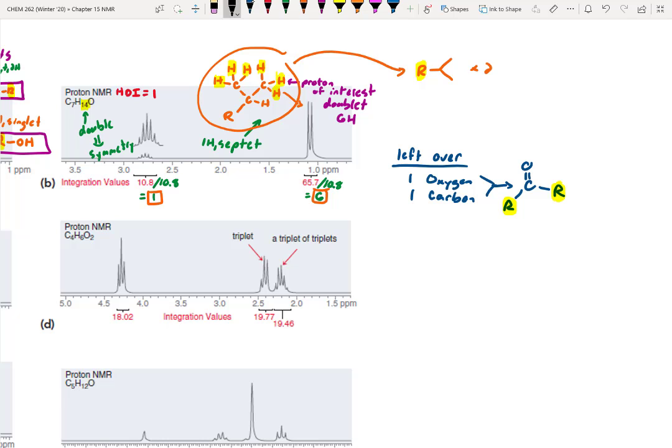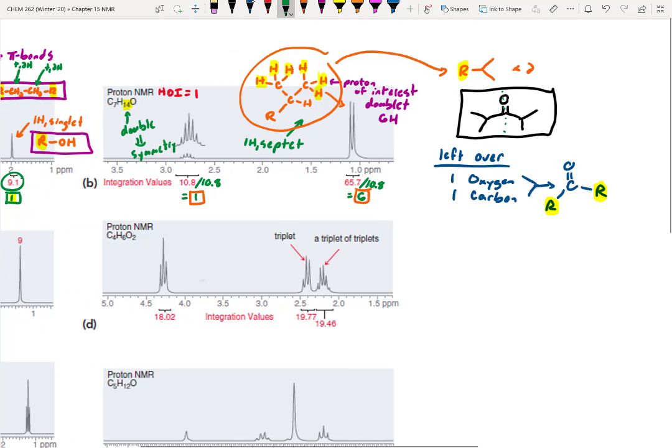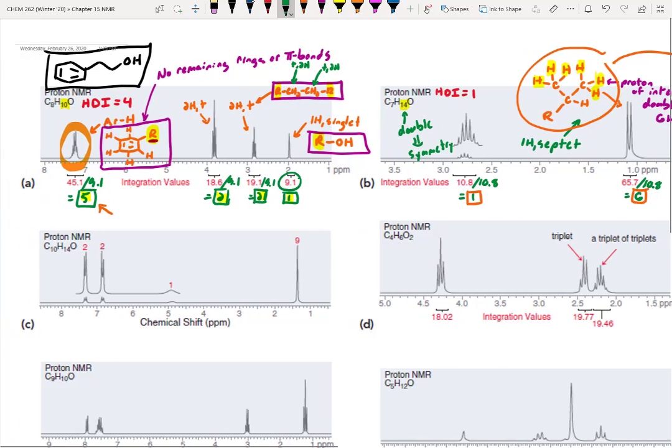Okay, so now we can go ahead and say, well, this makes sense. If it were this, that would give us all of the clues, and it makes sense because if we cut this in half, the left-hand side is the exact same as the right-hand side, which is making everything kind of come together. Does that make sense? So these are a little bit tricky when you're working through some of them. All right, let's do the next one.